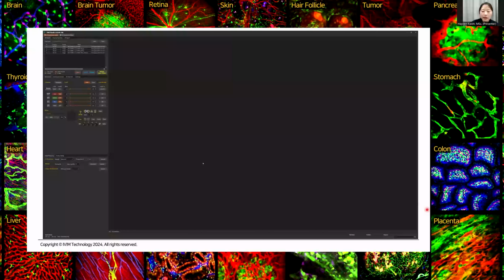To begin, let's proceed with the post-processing of the acquired data by adding the hive directory folder into IVM Studio. You can see it on the left here. After that, you will have access to all the categorized files. Within the software, you can double click or just click this open key to see the data acquired during the previous imaging session.